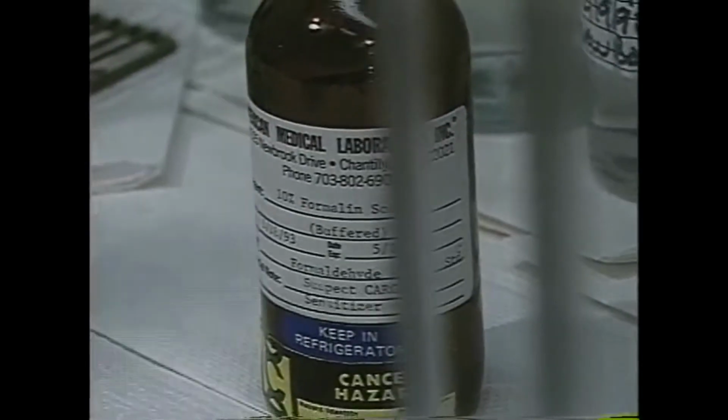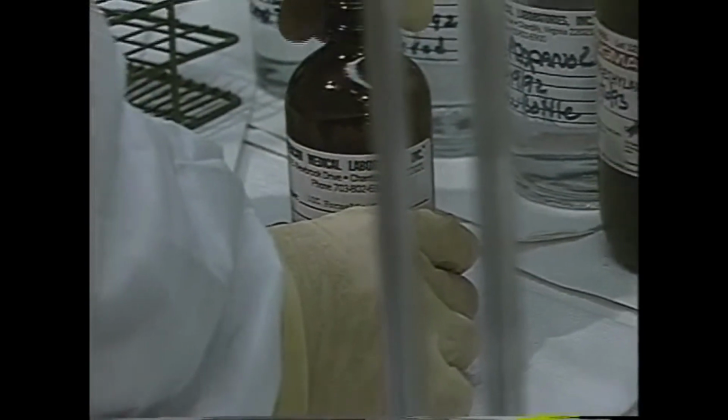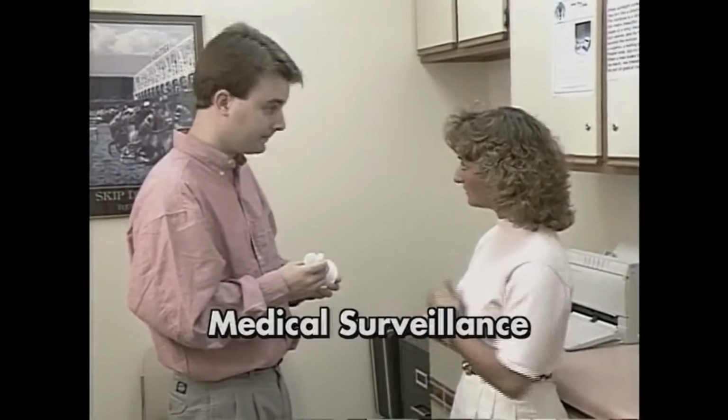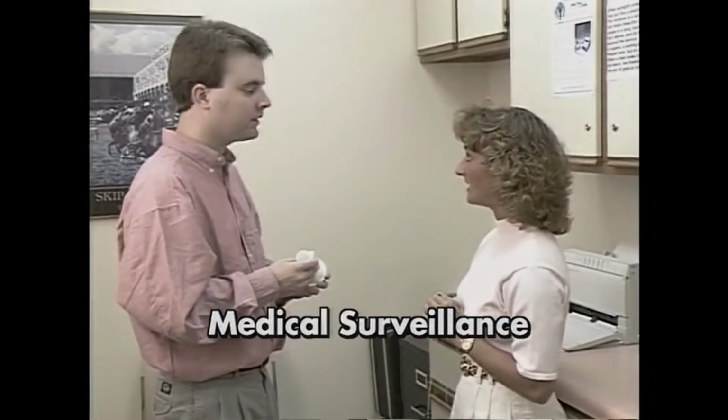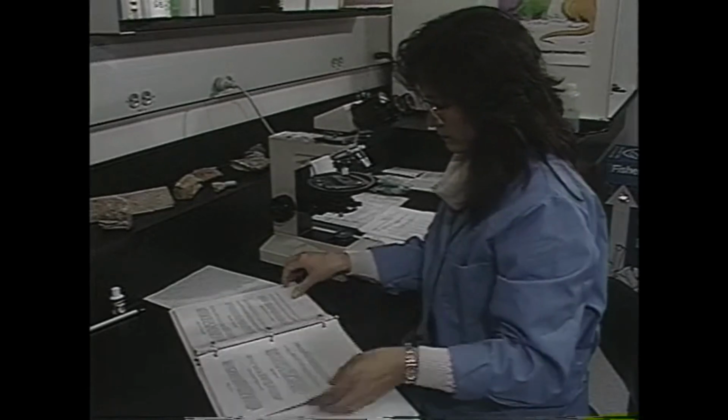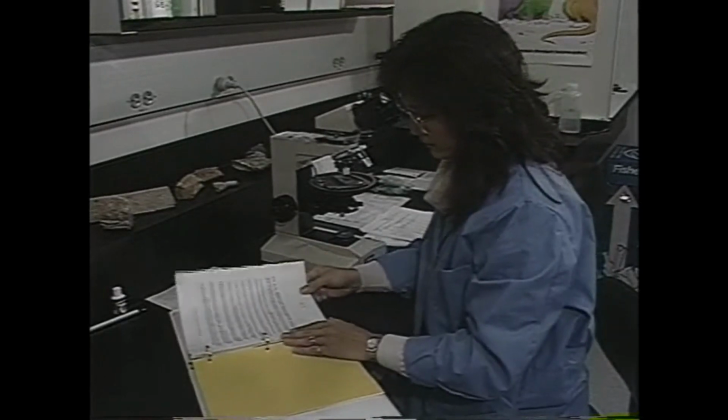Work with some hazardous substances, such as formaldehyde, is specifically regulated by OSHA. If you work around these types of chemicals, medical surveillance in the form of periodic examinations or medical tests may be required. Any medical consultations, examinations, or tests you receive will be performed by or under the direct supervision of a licensed physician and will be provided to you free of charge. For more information about medical examinations and surveillance, consult your supervisor or your facility's chemical hygiene plan.